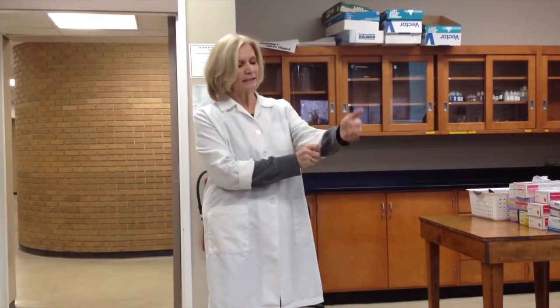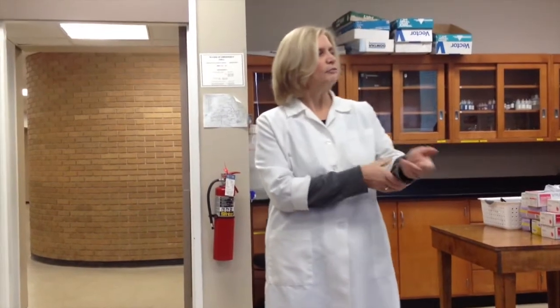If you don't have long hair, you may have sleeves that are quite open and that would drag across things. So be careful with your sleeves. You want to roll them up or take off a jacket that might be cumbersome with the sleeves. You could have a dangling piece of jewelry that when you lean over could cause problems. So be aware of your own personal characteristics that might cause you a health hazard.